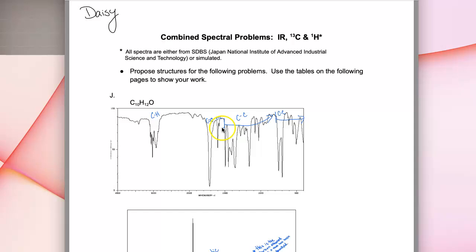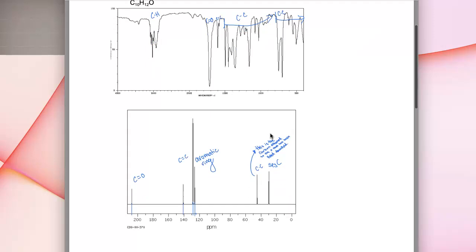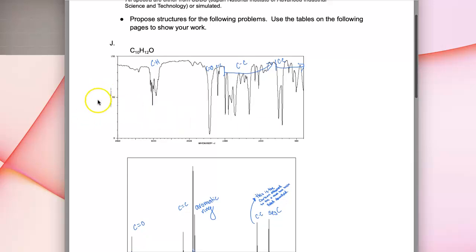bond C. And then the next region, we are able to see that there's nothing else extra sticking out, but it is our carbon-carbon bond range, which it does have. So next, we see where our other spectra aligned. So that was our IR spectra.